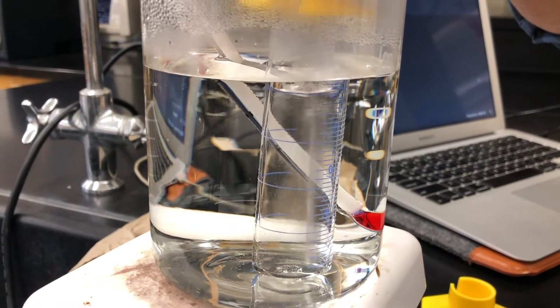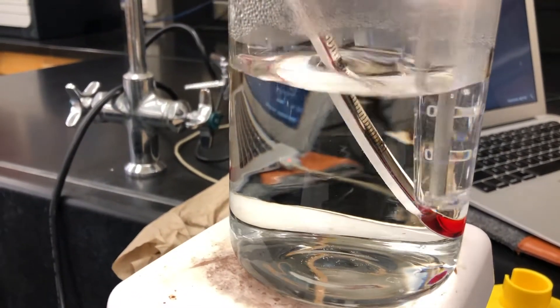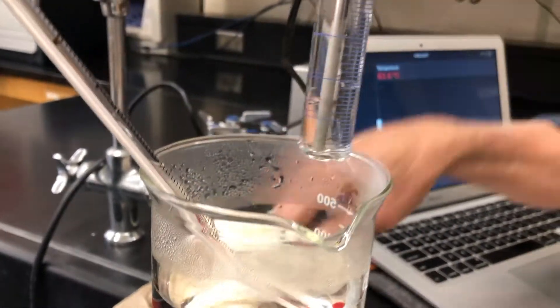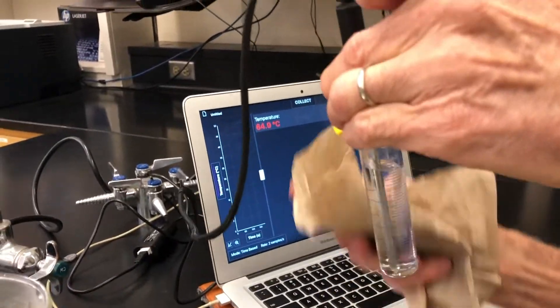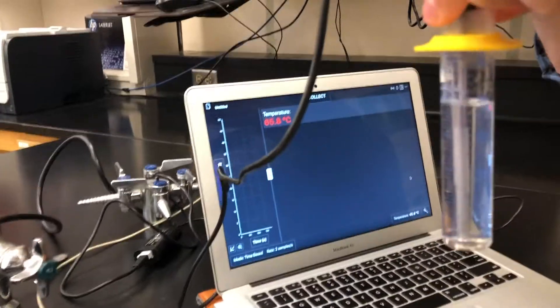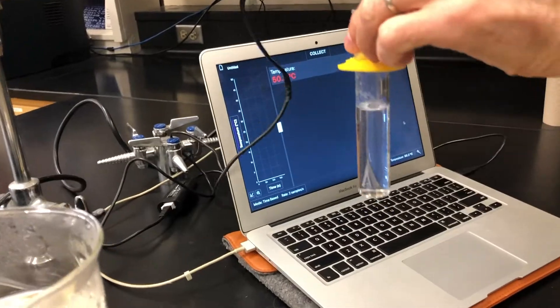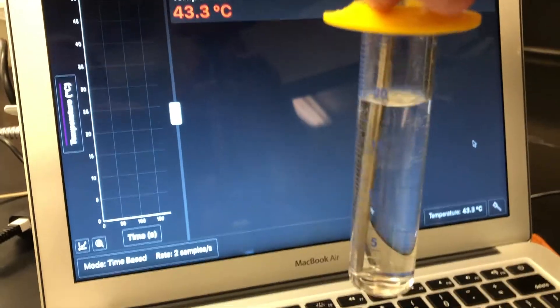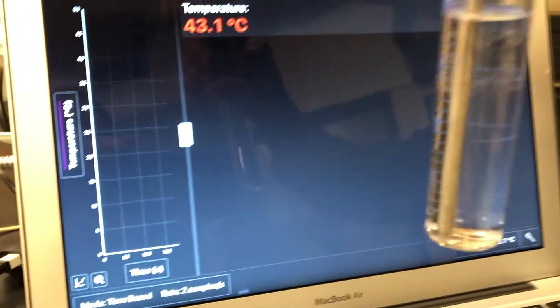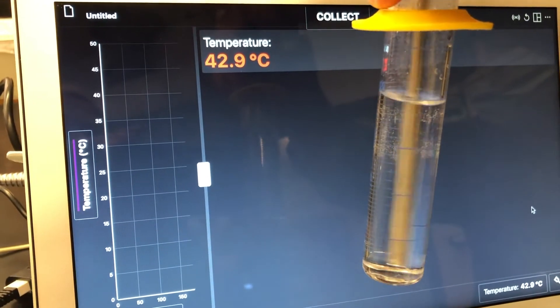Once it's all dissolved, remove from the water bath, determine the solution volume by estimating from the graduated cylinder, and then let it slowly cool with stirring. Estimate the temperature at which crystals just barely start to form. Remove the temperature probe and estimate the new solution volume to the tenth of a milliliter. Then monitor the cooling, pay attention to the temperature, and look for the first sign of crystal formation.